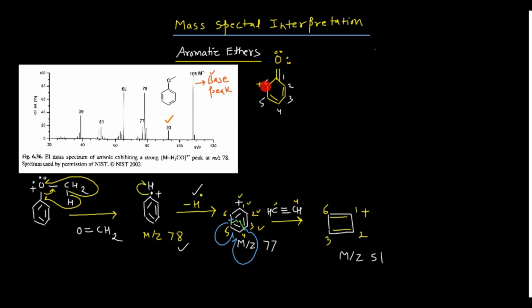This was the peak actually. Please remember, 6 carbons are there, 12 sixes are 72, and then you have the oxygen, which is 16, and then 5 hydrogens. So this will give you 93. So this corresponds to the m/z of 93.